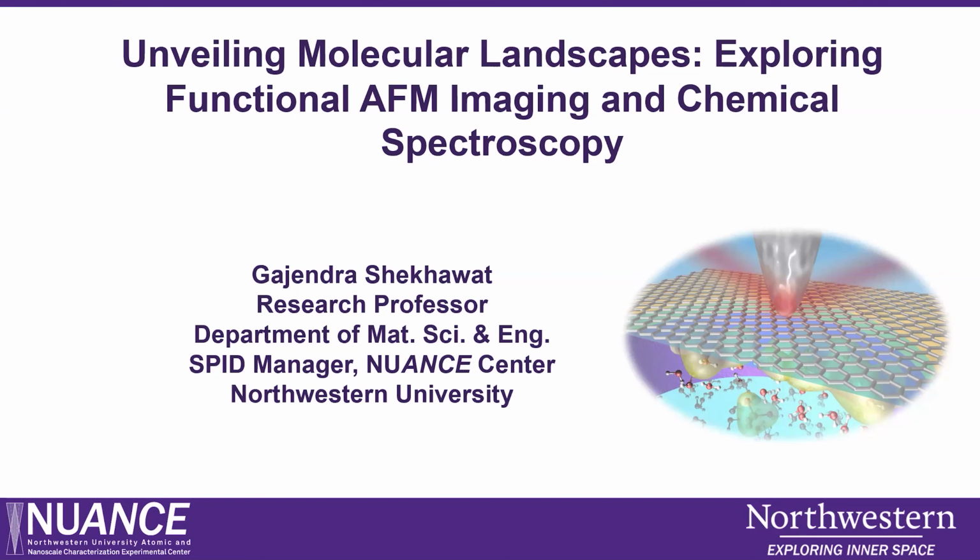If I go long back in the history of the AFMs within this facility, almost 10, 15 years back, we have seen that more people are interested in doing the surface morphology. They just want to know what is the surface roughness, how the 3D structure looks like, how the resolution looks like. Now, in the last 5, 10 years, things are moving towards more quantitative, more functional, and then also the integration of AFM with chemical IDs.